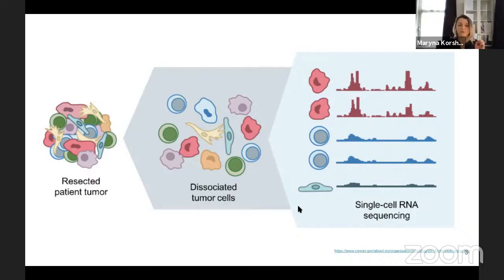So, speaking of which, may I interrupt you for a second here? Sure. So, at least in some fields, in neuroscience, in gastroenterology research, we have a lot of bulk sequencing data, and we have quite few, I would say, single cell sequencing data with some specific cell enrichment or something. Does it mean that we actually cannot use bulk seq at all for our single cell analysis? Are there any tools to, I don't know, uncover this bulk seq state?